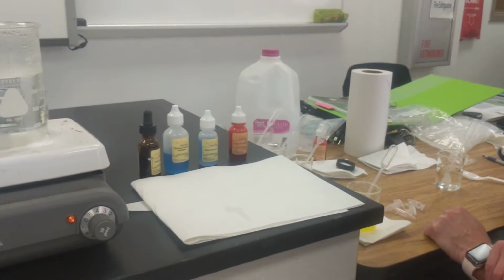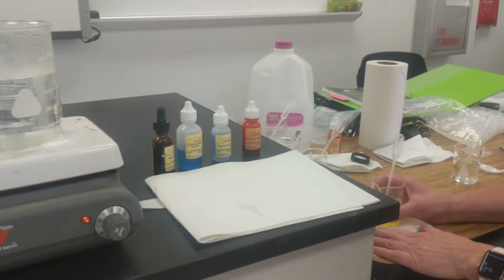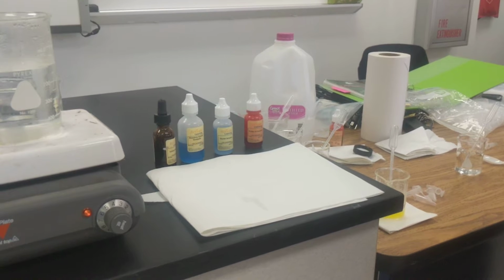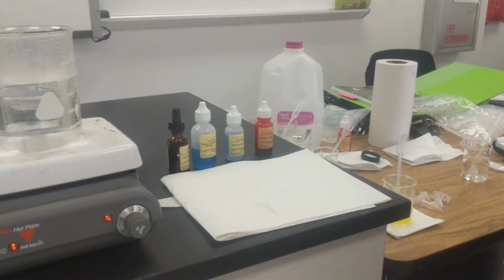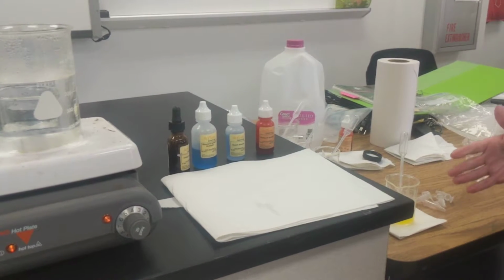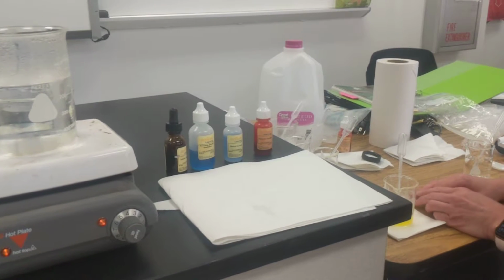All right, so our next item that I'm going to be testing is our butter. I'd like you to take a couple of moments to record your predictions for starch, for glucose, sugar, protein, and fats. What are we going to find in our butter? While you do that, I'm going to go ahead and fill these vials.